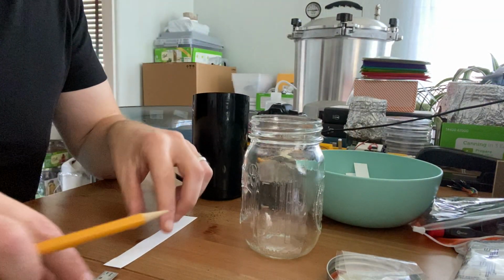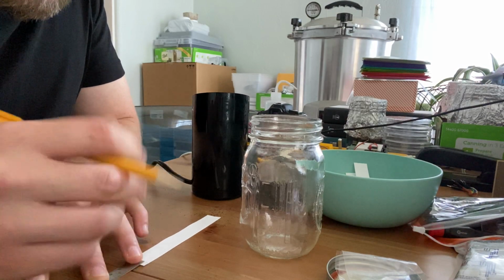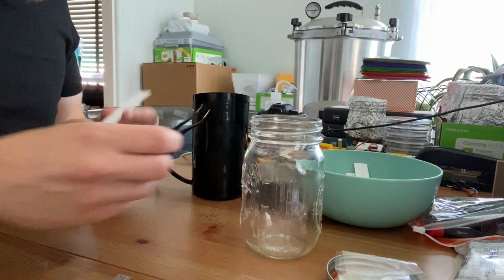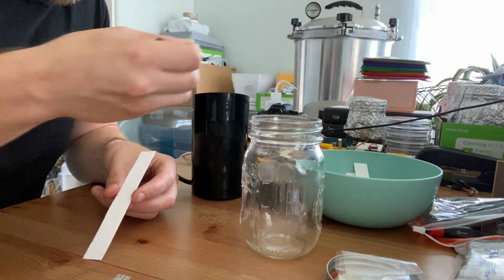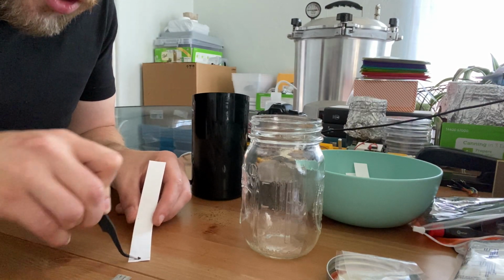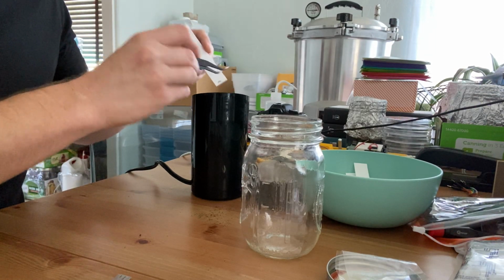So let's do that. So we're going to take our piece of paper here. I'm going to mark a 5 millimeter mark as my origin. And I've done that. Now I'll take my little tweezers, see if I can show that to you. You can kind of see a little marking right there. Now I'm going to take a little bit of this extract here, and I am going to take this little pinch, and I'm going to attempt to just put it on the paper and push it in, because I want to see if I can get as much of the oil, the extract, from that little bit into the paper. Kick off some of the excess here.